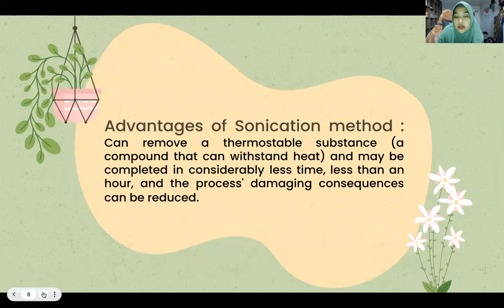The advantage of the sonication method is that it can remove thermostable substances, which are compounds that can withstand heat, and it may complete in considerably less time, less than an hour, and the damaging consequences of the process can be reduced. Sonication is based on the use of ultrasonic waves to generate cavitation. Cavitation produces energy, raises the temperature and the pressure, and causes damage to the material's outer surface, causing quicker mass transfer, faster extraction, and higher yield. Next slide will be presented by Belva.